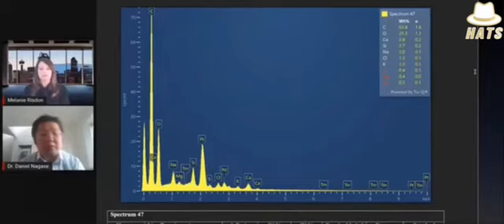Thulium is a very unusual contaminant. Yeah, it's very unusual. I wouldn't... it would be presumptuous for me to say it's a contaminant. It could have been added intentionally to the sample, and when it forms fibers, it gathers the thulium for some reason and incorporates it in the fiber for some reason. So again, this is a lot of questions. What is exactly going on? So let's keep scrolling down.